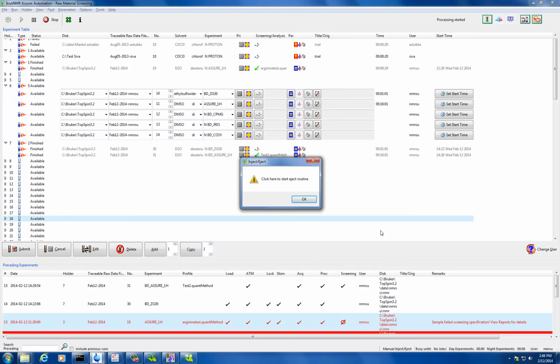Even apple and orange juice can be quite complex, but in Germany they ran thousands of samples, so I guess they could really understand that variance. They have a huge database. Do we have a database for cranberry juice? Not yet.